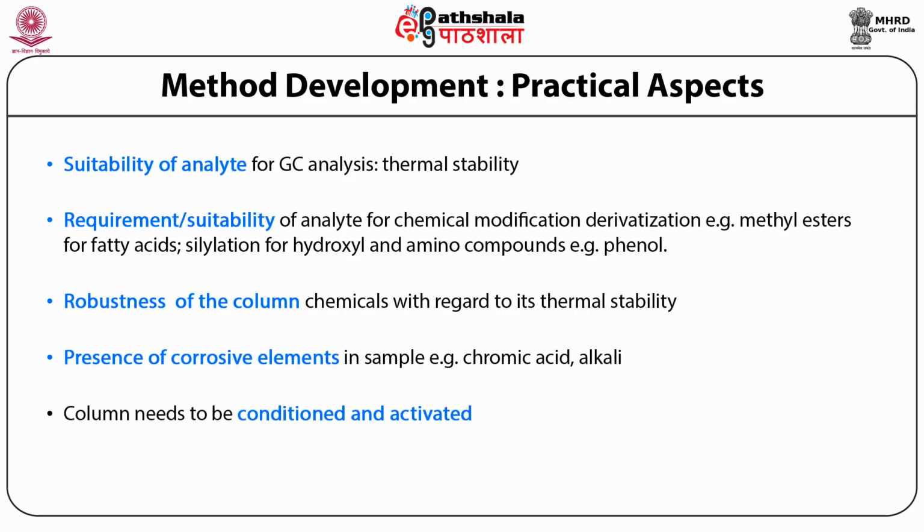Conditioning is a prerequisite before starting any of the programs or methods, and that essentially removes the components of bleed, essentially puts the column in readiness to accept the sample so that it can be analyzed in an optimal fashion.